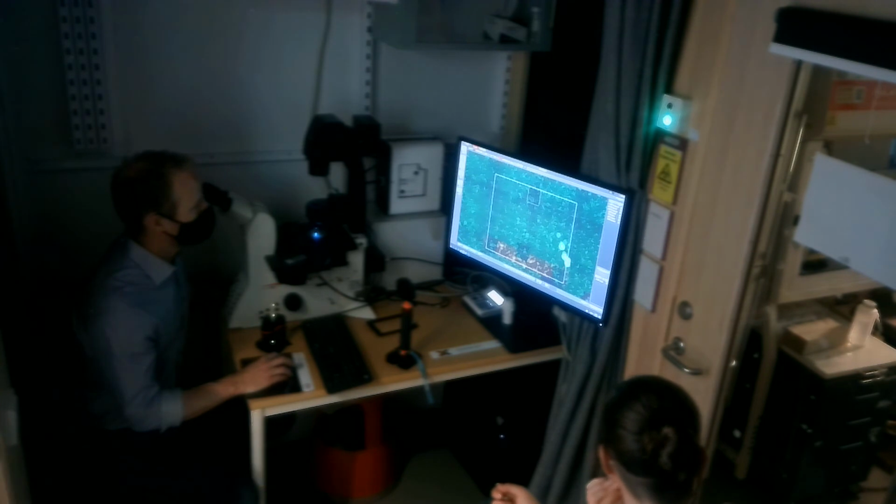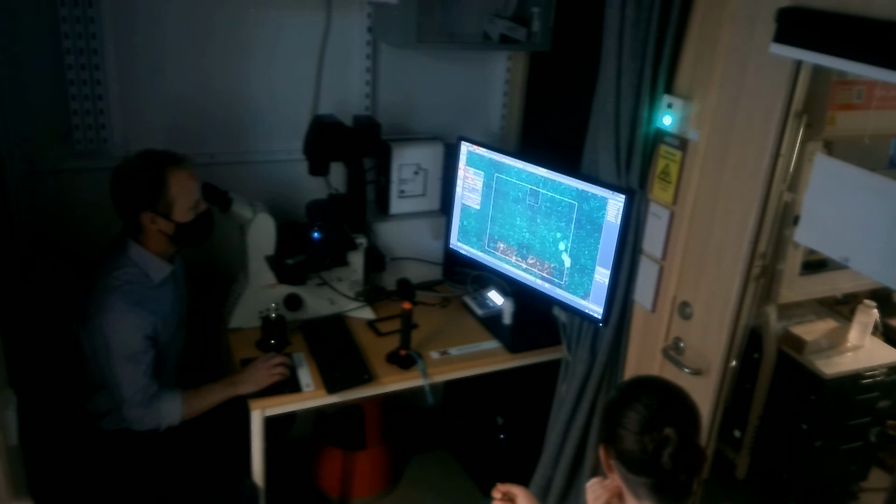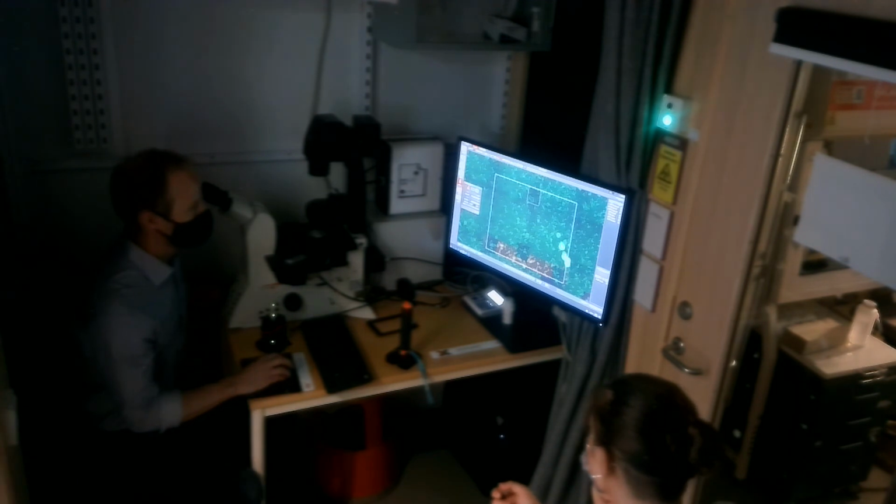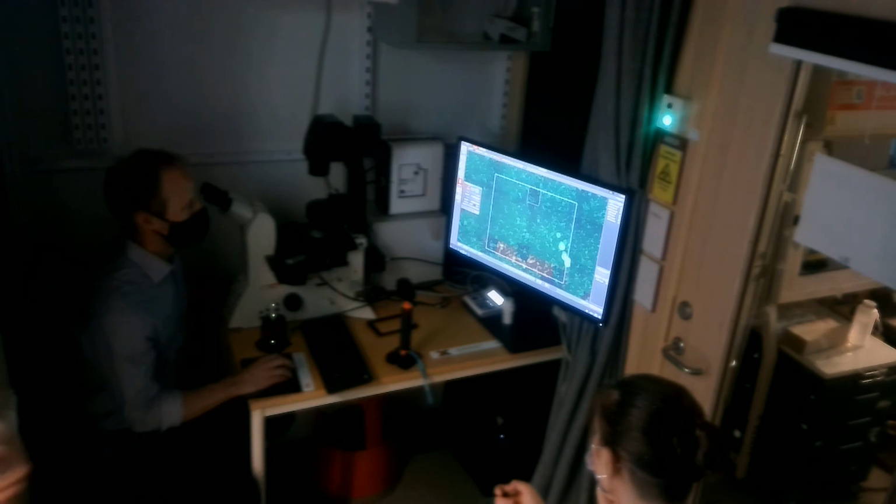So I will go into here, and as you remember, when I activate autofocus I can't be live, so I will stop the live. That will allow me to press the autofocus panel. It comes up here, and it looks the same as before. So here we have my settings. We can't change everything here. Most of it, or a lot of it, is fixed.